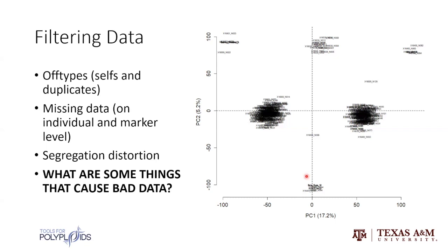Maybe minor allele frequency. Sometimes in GATK or in upstream processes, you might set a minor allele frequency filter, or some other filter, that downstream becomes NA just because it's a hard filter that was applied very early on. So yeah, those are all good answers.